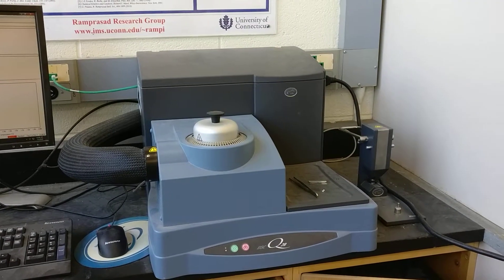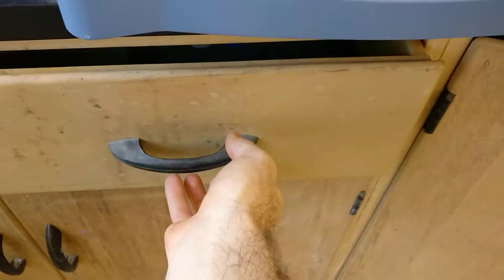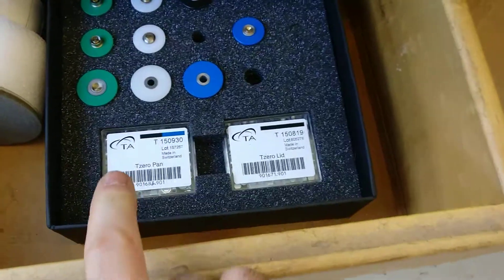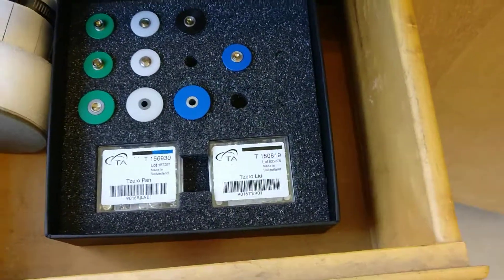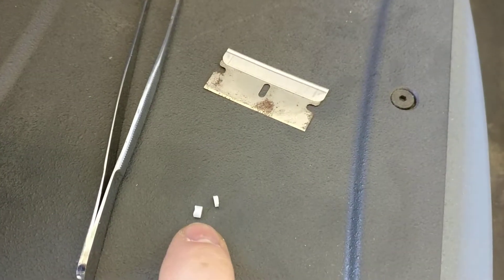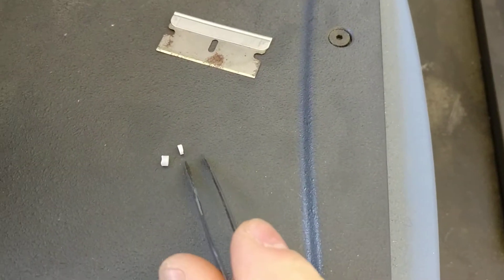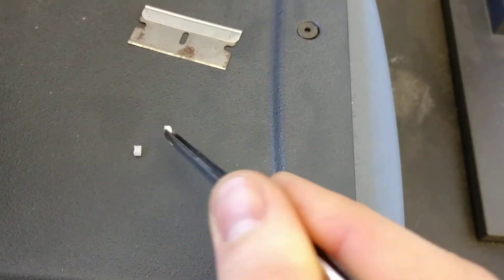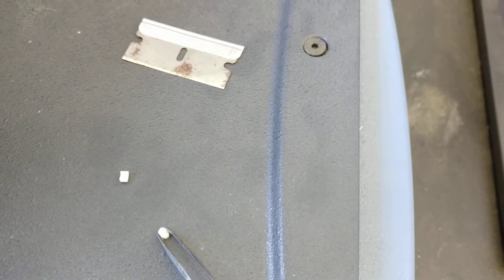The next thing is the sample preparation and loading procedure. You're going to go into this drawer here. Inside you'll see boxes labeled T0 pan and T0 lid — grab those. You'll also grab a thermoplastic pellet, a razor blade, and a pair of tweezers. You're going to cut a little slice off of that pellet, and this is going to weigh three to five milligrams.